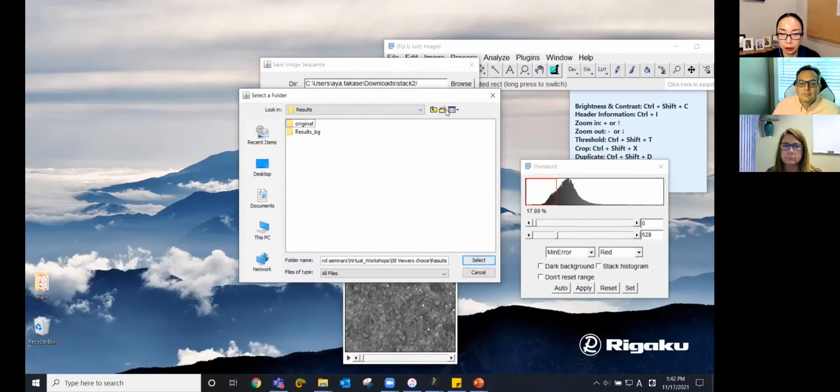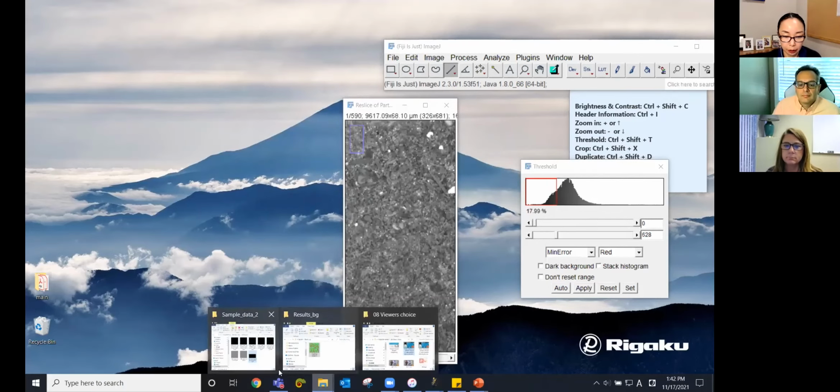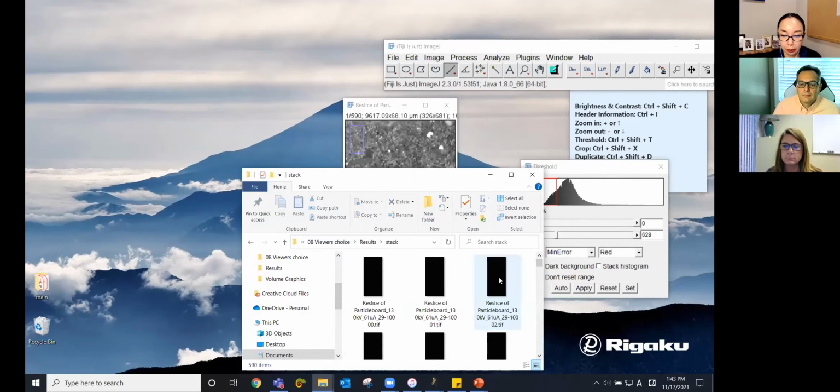Let me show you how this will go. Let's save this in the results, and I'm going to make a folder for this. If you save it this way, what's going to happen in the results folder? This is the one we just created.